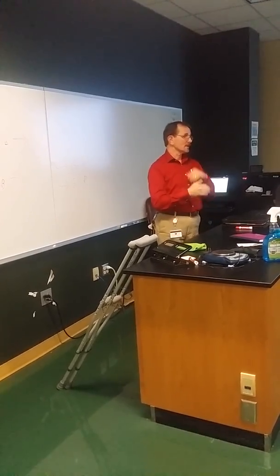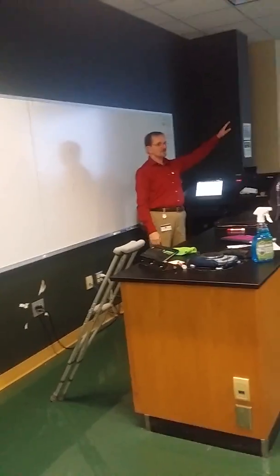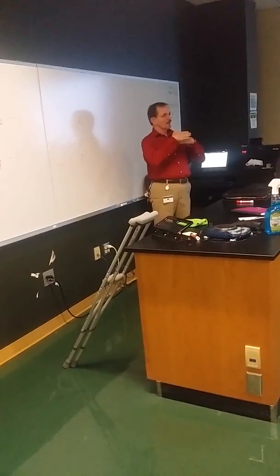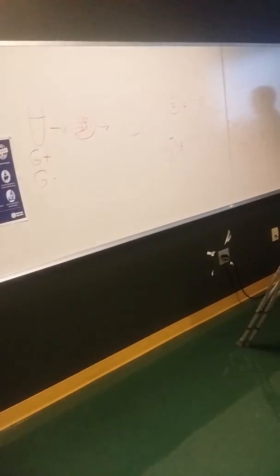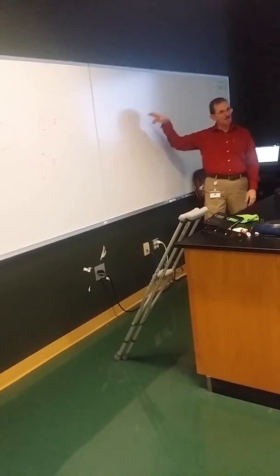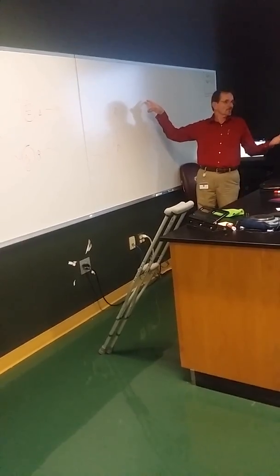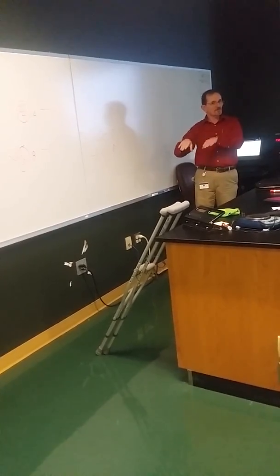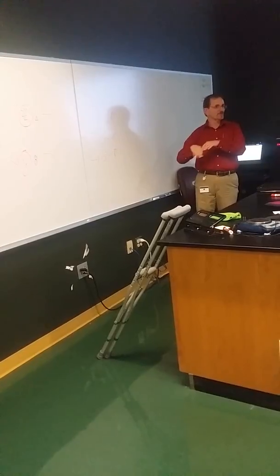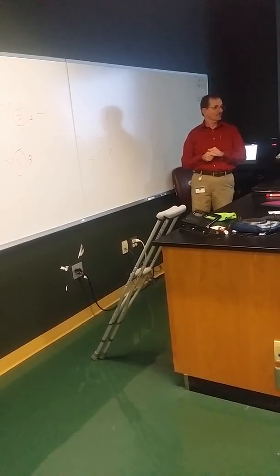Make sense to you guys? Now, having said that, you still need to do the results in a separate section. I'm just trying to tell me why you did the next step. If you said you got a positive glucose and the next thing you did was maltose, I want to be able to follow behind you to see where you might have jumped off the right path. Make sense, guys?